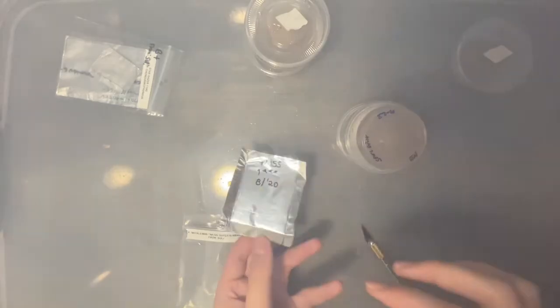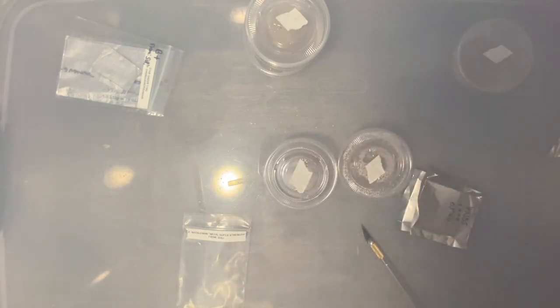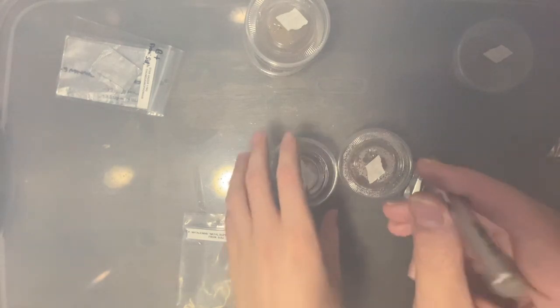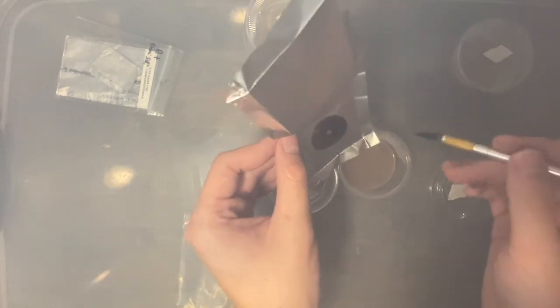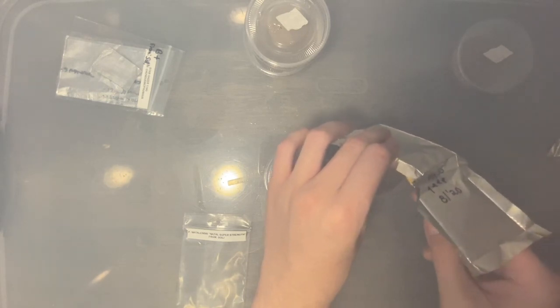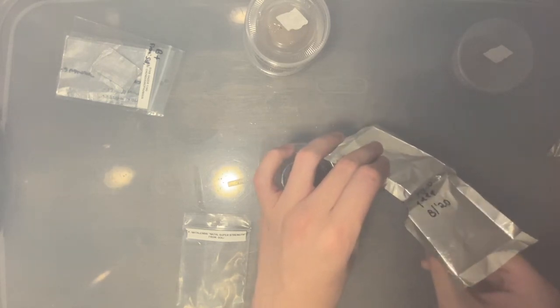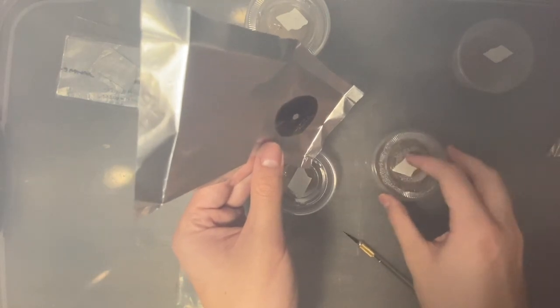Okay, let's take a look at the print. Well, actually, I'm gonna spray my hands down first. Beautiful thick print. Very nice. I'm gonna dip it in the agar to cool it down. Okay. Hello spores. I know I'm doing way too much. I don't need this much.